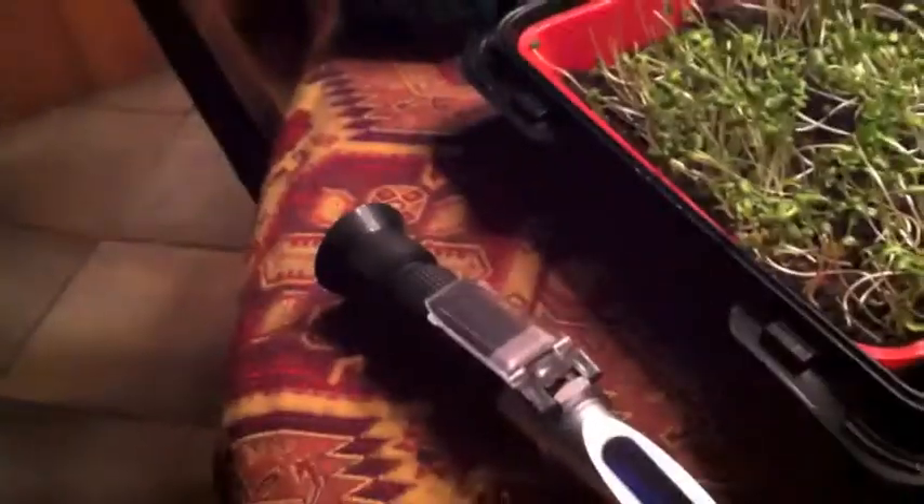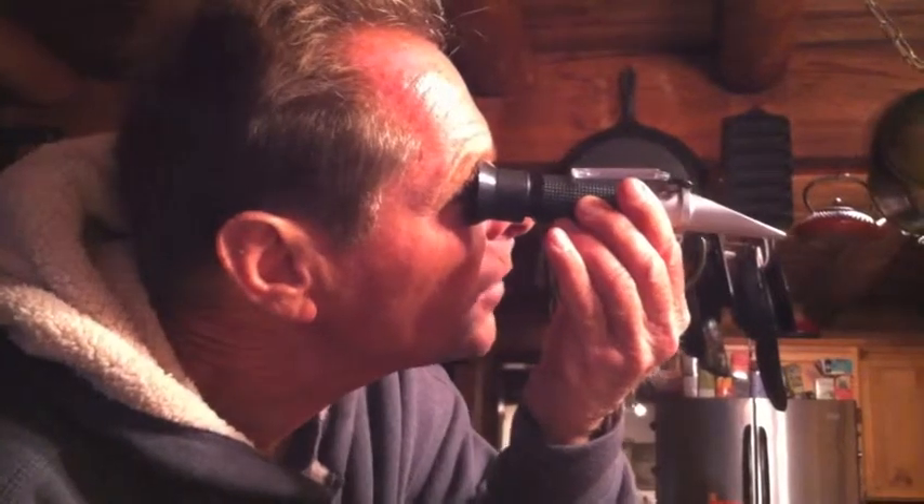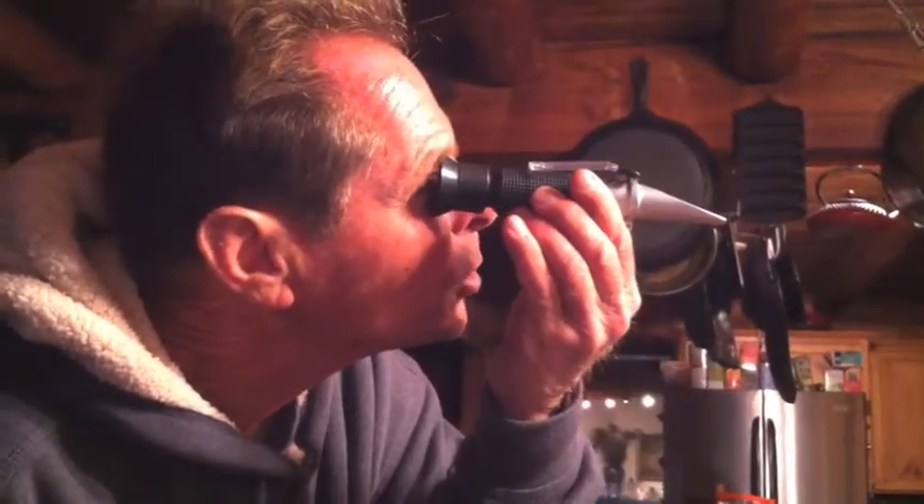So this is a refractometer. Can you tell me how that works? You look through the lens here, and there's a scale up against light. You'll see there's a series of numbers — at the bottom it says Brix, and it starts with 0, 5, 10, 15, 20, 25, and goes up to 30.